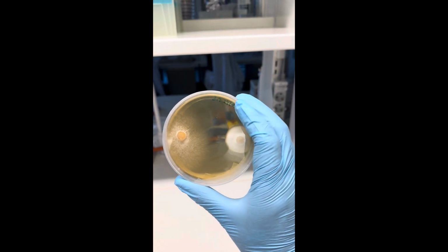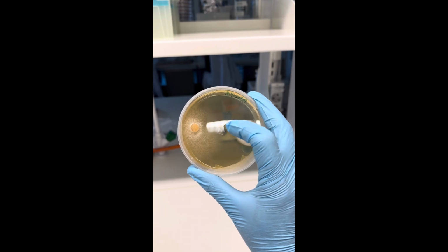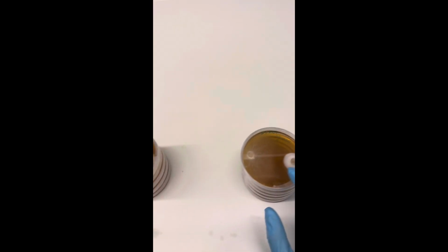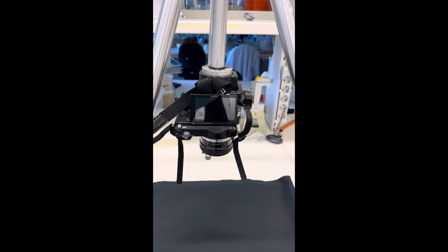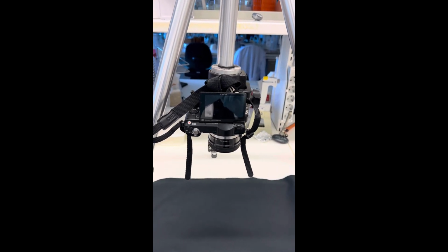And also this one, there is still a gap, but I'm sure when Heterobasidion grows closer, it will also make a convergent form. But let's see. Right now I'm going to take the snaps of these plates with the help of this camera, and then we will decide with my superior how to proceed with this kind of experiment.